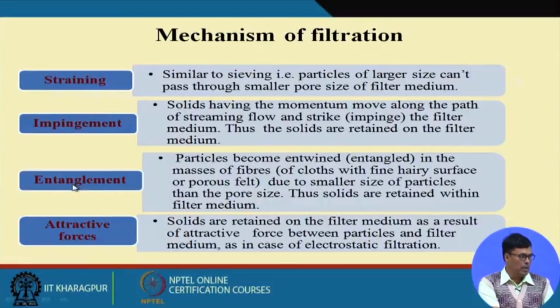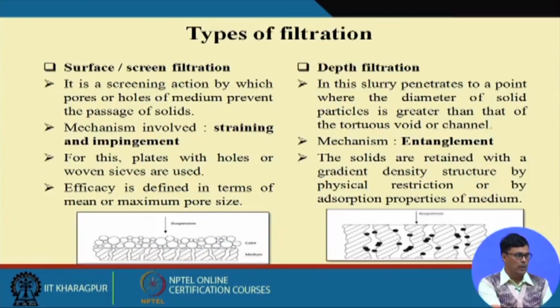So this is the entanglement, where the particles become entwined. They are entangled in the mass fiber due to the small size of the particle relative to the pore size. Thus the solids are retained within the filter media. Attractive force: solids are retained on the filter media as a result of attractive force between the particles and filter media, as in the case of electrostatic filtration, because if your particle has the opposite charge, then you can easily separate it by attracting the opposite side, and other things will be filtered out.